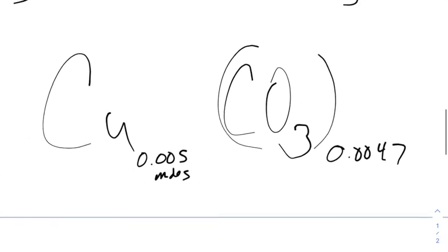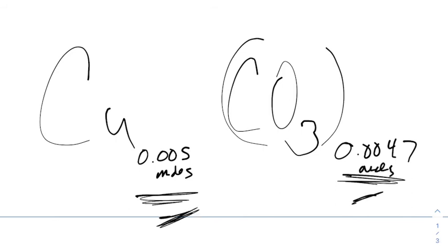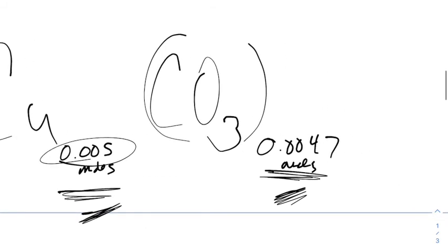So that is now my number that goes here, 0.0047. So just by looking at them, can you tell, is this a 1-to-1 or a 2-to-1 ratio? Are these numbers almost exactly the same? Or is this number here about twice what this number is here? Well, let's just do a little rounding here. This is 0.005. This is 0.0047.